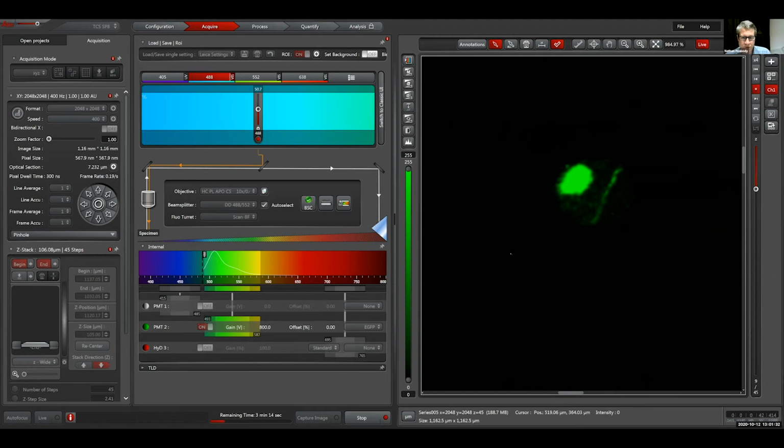Which is sort of a false sense of security for you guys, because GFP, the way we do it in flies, has a really great signal. But antibodies do not have a good signal because antibodies are fairly limited on how well they interact. Or DAPI only has so many things attached to the nucleus. And so you can ruin them fairly quickly. But GFP is just like the nucleus is cranking out GFP like a factory. So there's just so much of it.